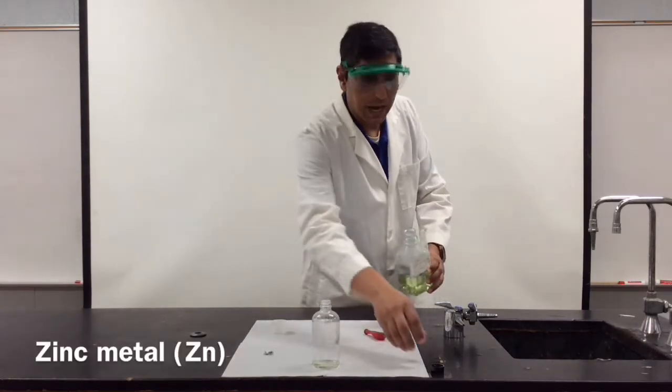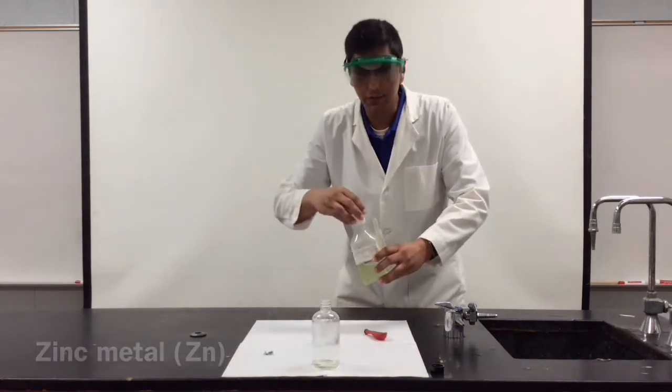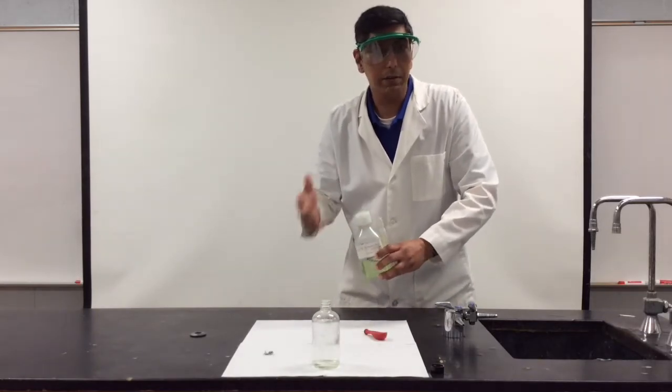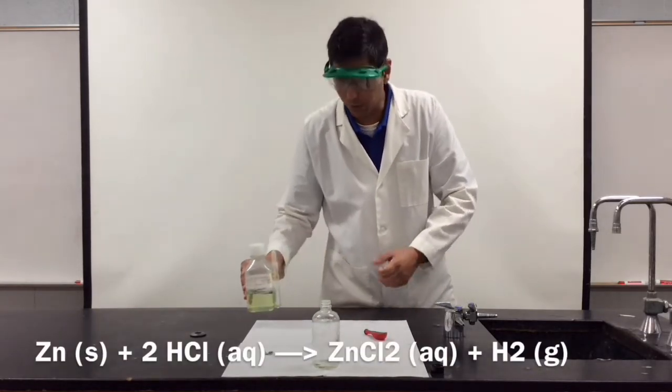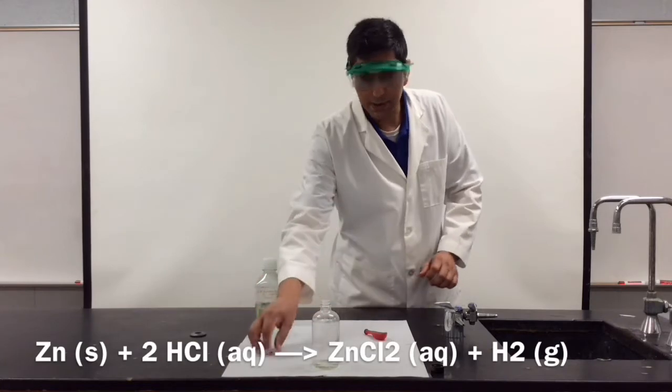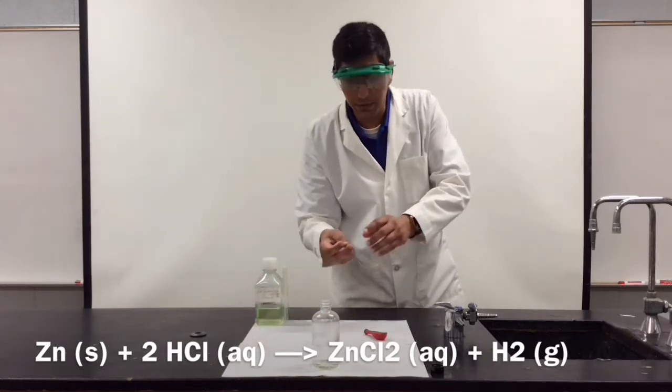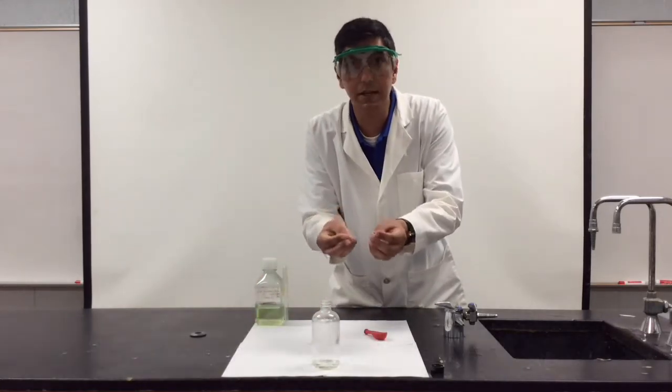Now zinc metal reacts with hydrochloric acid to produce hydrogen gas and zinc chloride. So we're going to see what happens. Now the hydrogen gas as we know can be collected. So I'm going to drop the zinc metal.